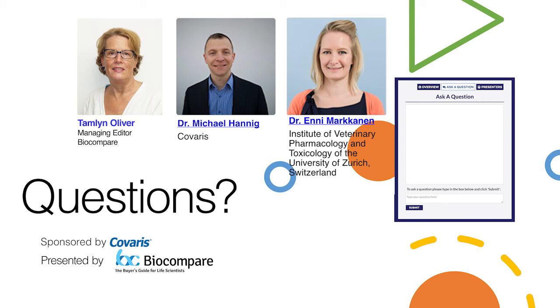So we routinely use 10 micron sections. In the beginning, when we started setting up this workflow, we tried, of course, different section thicknesses. And the thing was, if the section is too thin, you really struggle to get enough material because you get really low amounts of material anyway, as you saw in the presentation. And if the sections are too thick, you cannot really discriminate anything anymore under the microscope. So in our experience, really 10 micron is the optimal thickness to be able to see what you're isolating and also to get the nicest yields of RNA out of your sections.